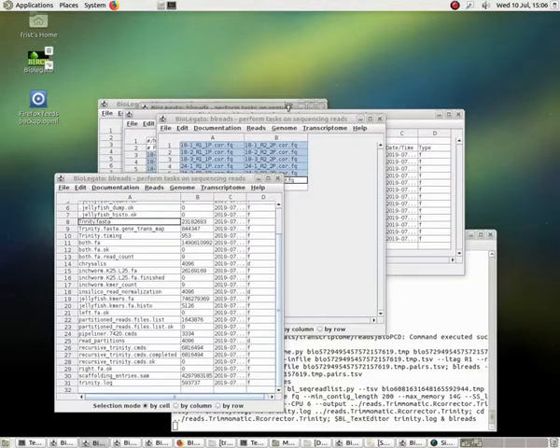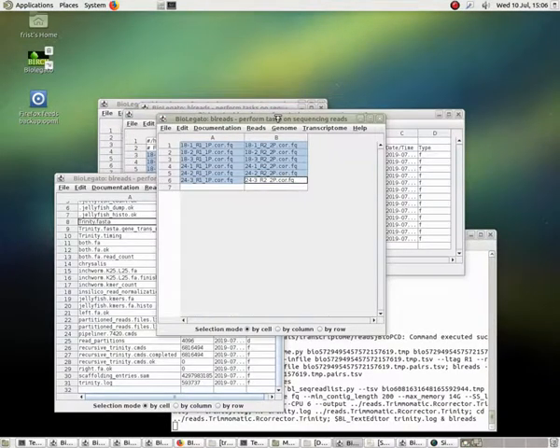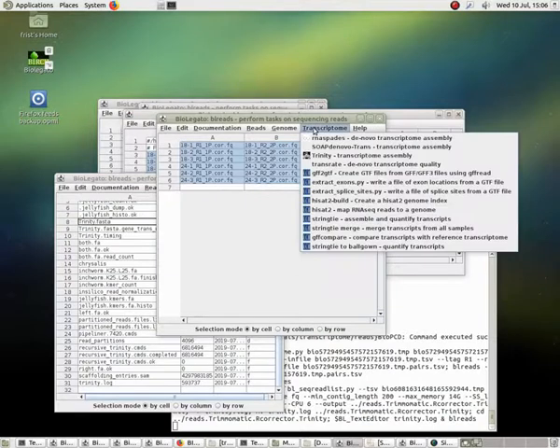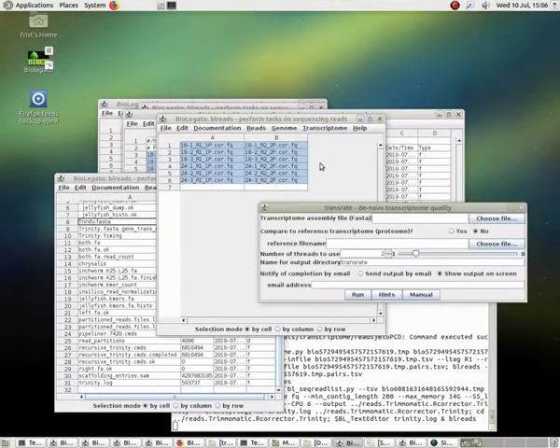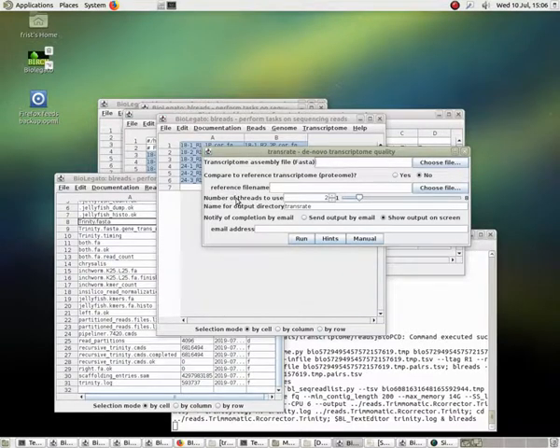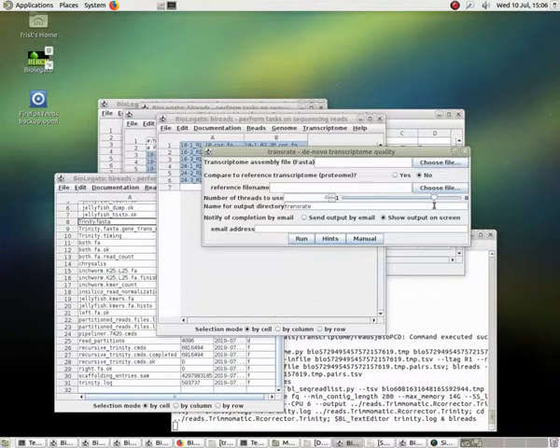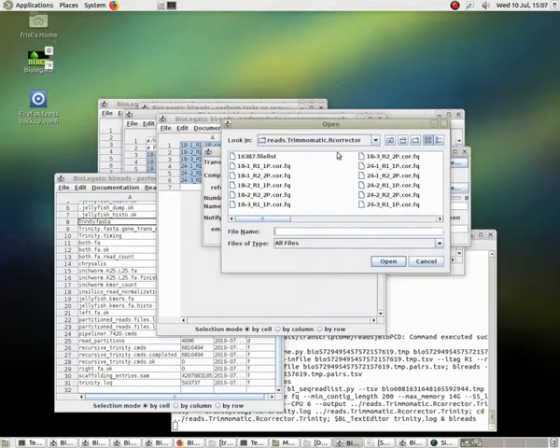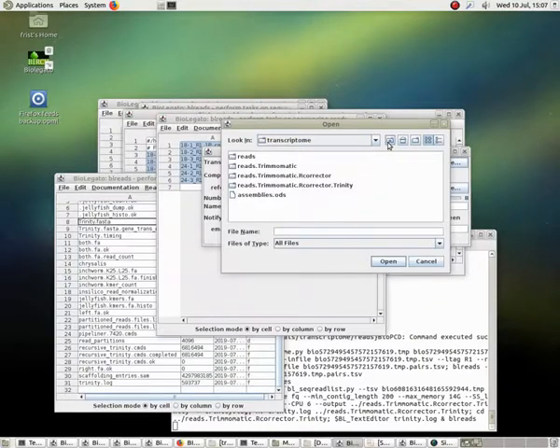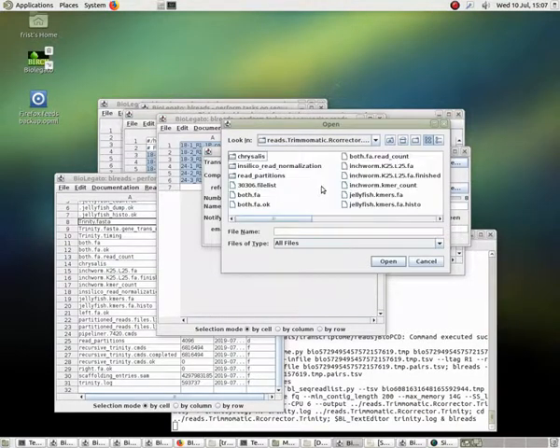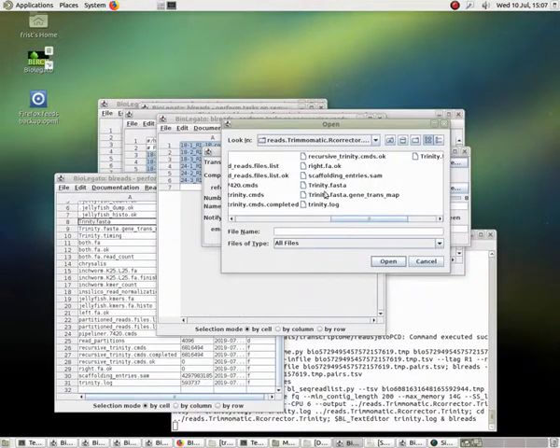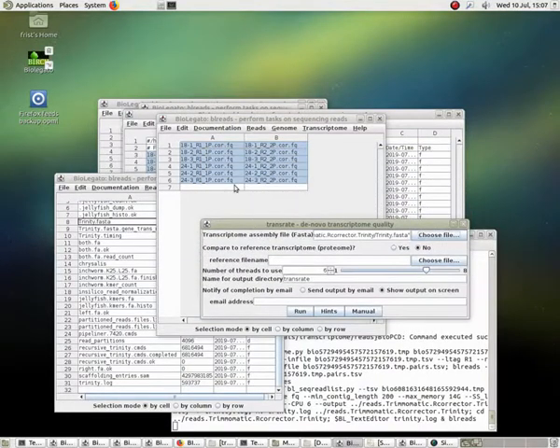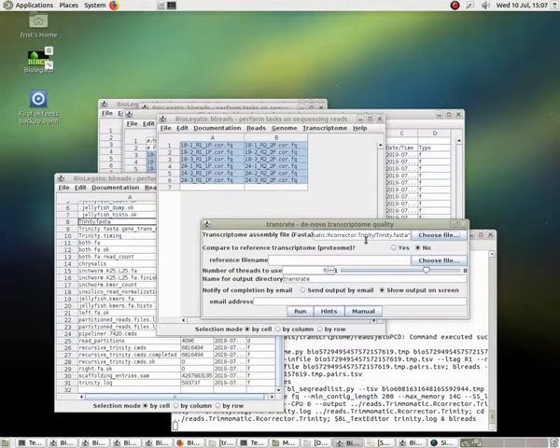The last step in this process involves going back to the reads, the corrected reads that we used to make the assembly, and we want to run a program called transrate that will give us a detailed report on the quality of the assembly. This will involve going back to the original reads, reading all of them in again, and then also reading in this trinity.fasta file. The transcriptome assembly is what we have to choose. We have to go up one directory because these reads are in the trinity reads.Trimmomatic.Rcorrector directory. We need to go into the trinity output directory and grab the trinity.fasta file.